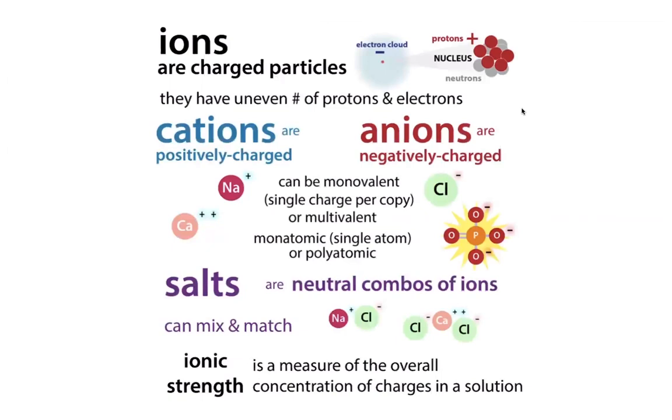Right, the interactions are going to be weaker. And so we might see fewer detections, we might see fewer proteins detected, and we might see lower amounts of those that are detected. Remember that even for non-permanent charges, even non-ionic interactions, we can still think about them as on some level being partially charged based.